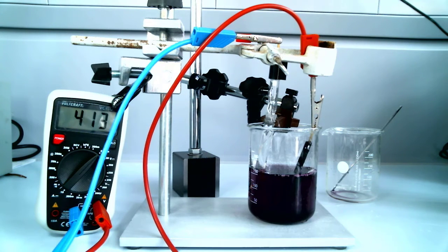Next time we will try to do this using an iron electrode, which adds another component to the possibilities. We might only add one of the two iron salts in that case, because otherwise we have too many things going on. Obviously with the carbon as an electrode, it makes sense to add two salts so that we've got a redox couple in there. We'll try this again next time when I get back into the lab.